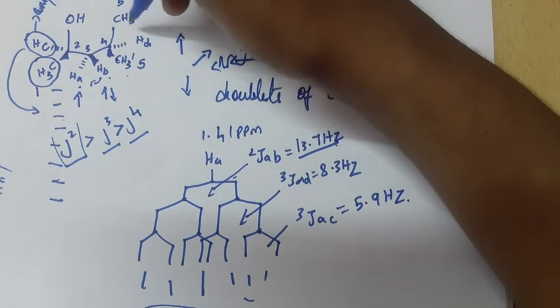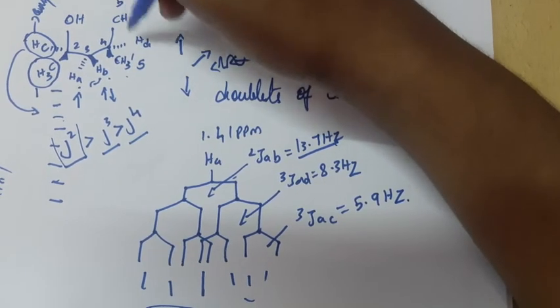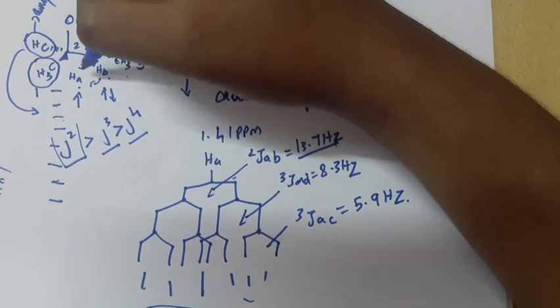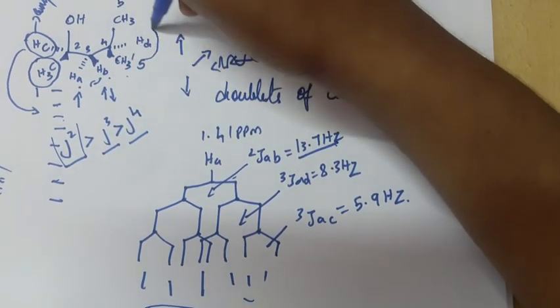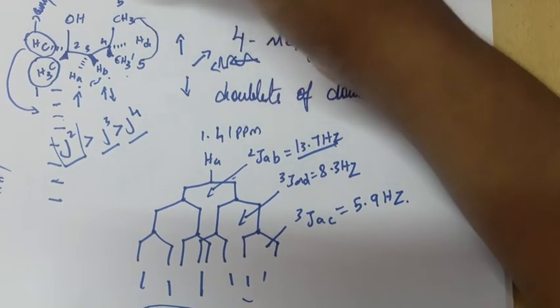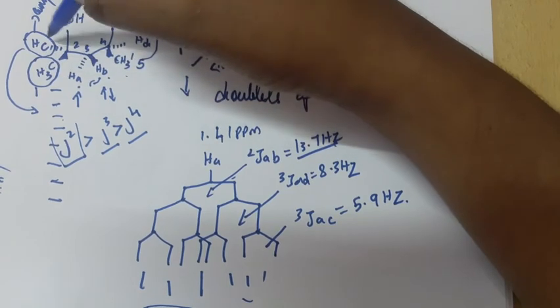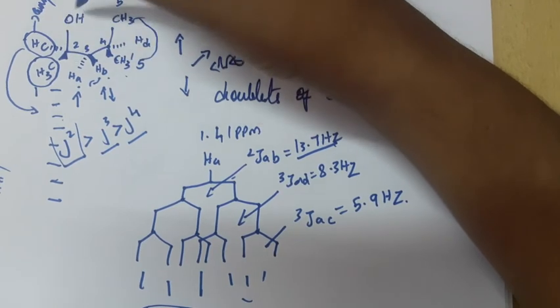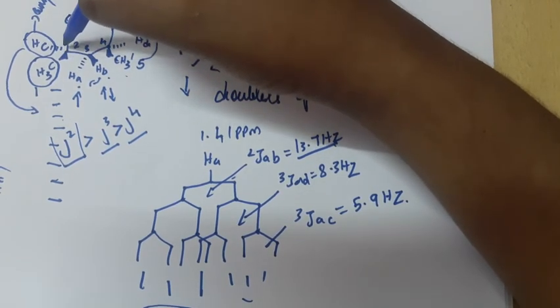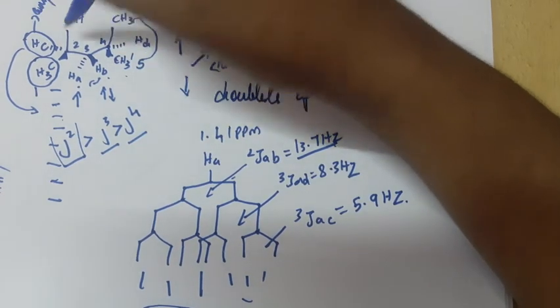These two CH3 are similar. They are magnetically as well as chemically equivalent. These two are chemically equal. Oh, not even chemically equivalent. They're going to be diastereotopic and magnetically inequivalent too. These two are going to give the same spectrum, and HC and HD are going to give a different, fairly complex spectrum. And this thing, I think, only has a long range coupling. We have 2 things over there.